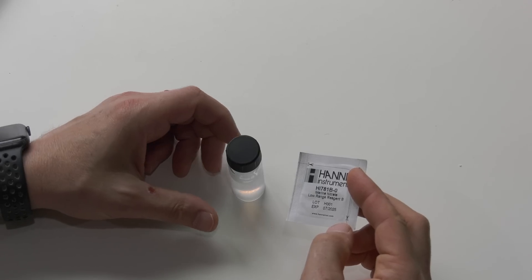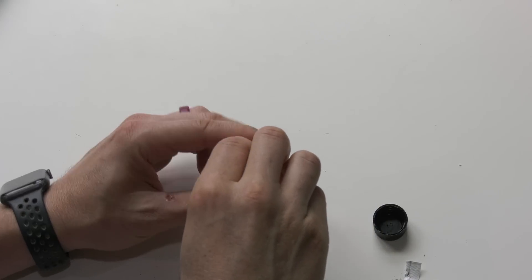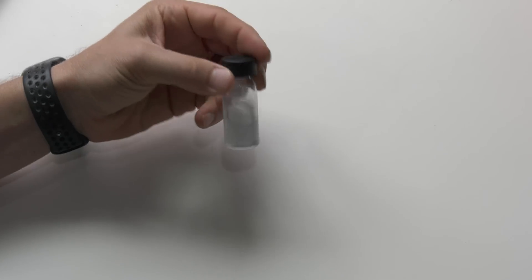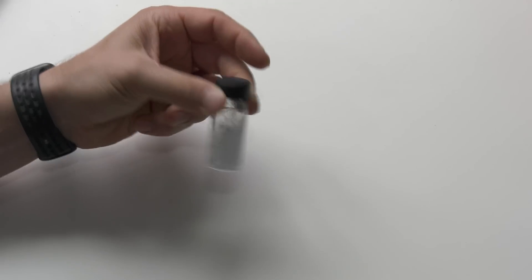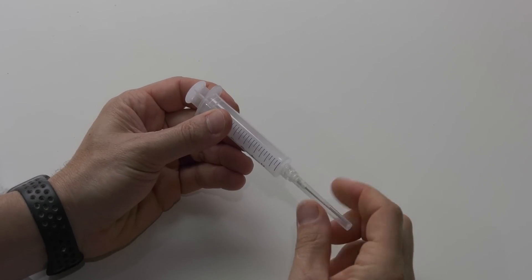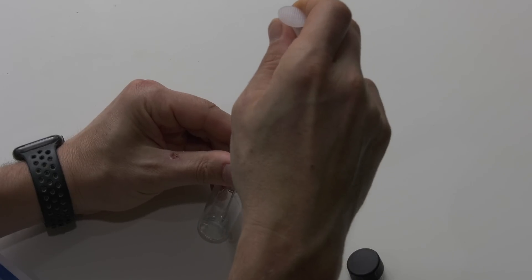Then add one packet of reagent B to the large mixing vial. Replace the cap and shake for one minute — and yes, you can shake it hard. Then attach the included blunt needle onto the 10 milliliter syringe. Remove the cap and draw 10 milliliters of solution into the syringe.